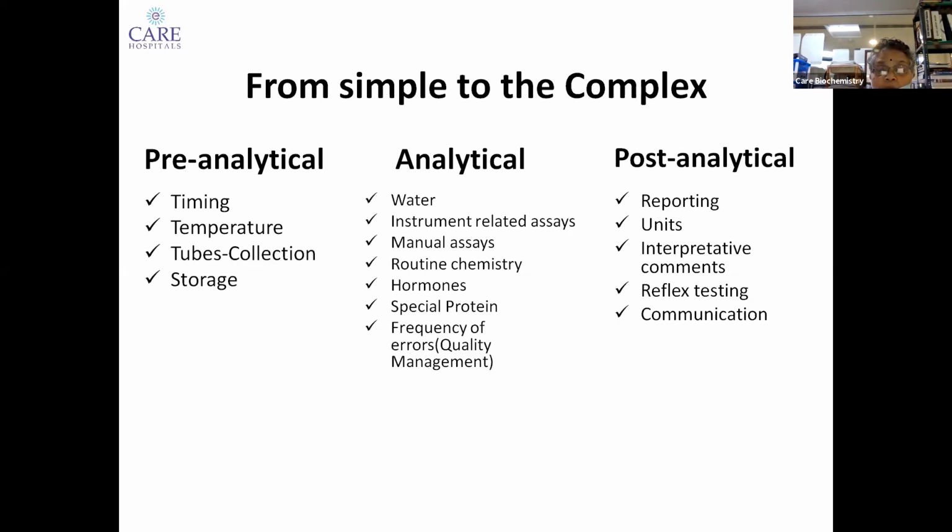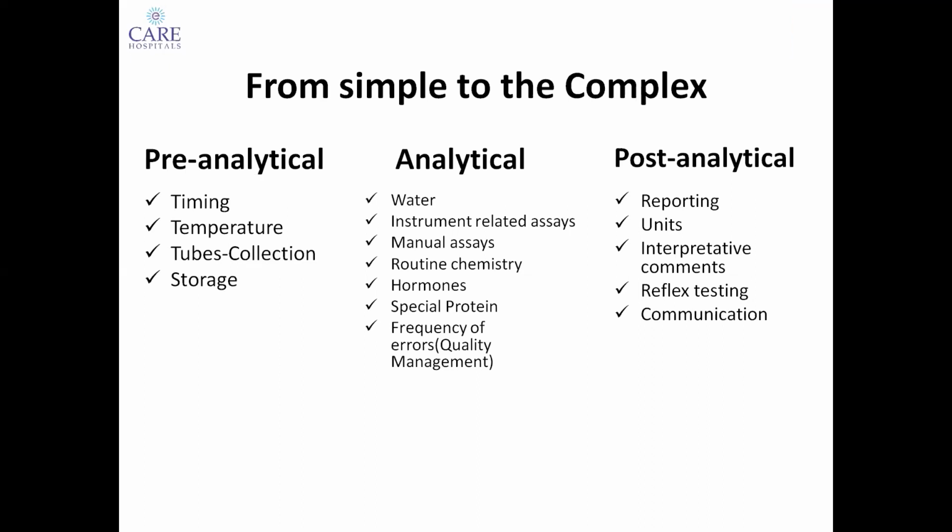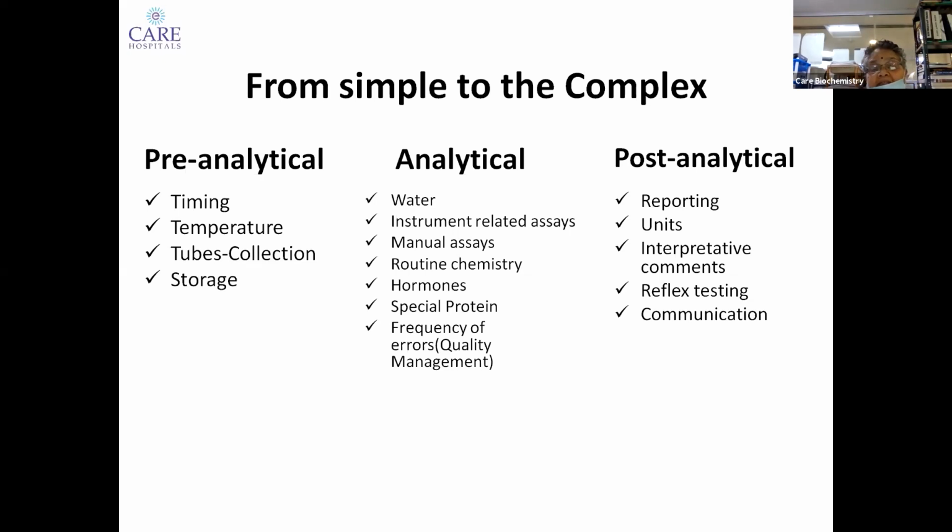So our issues start from water. So imagine a small place, a rural area where we have a lab. We are doing hormones even in those labs nowadays, but what is the water source? And especially in a rainy season, how do we approach this problem? Even in our big cities, when there is a cyclonic threat or a tremendous downpour, and you see the filters that are there in your water systems, they are just more than brown mud. So one has to be very careful, especially after these seasons. So water is absolutely a challenge to all of us.